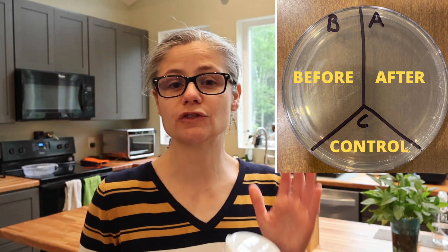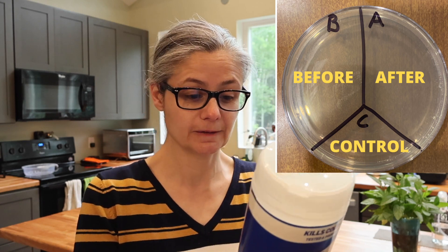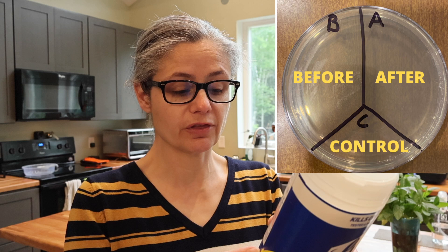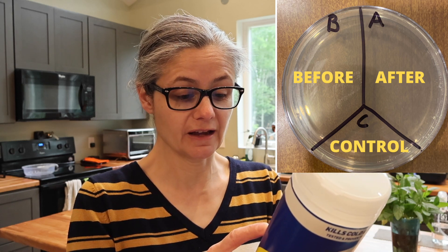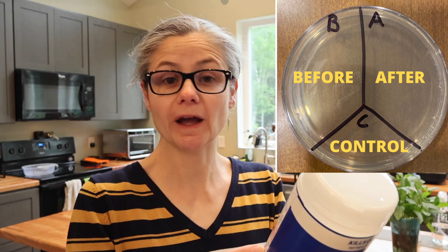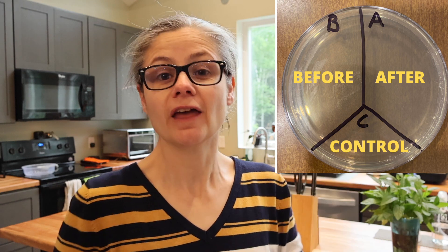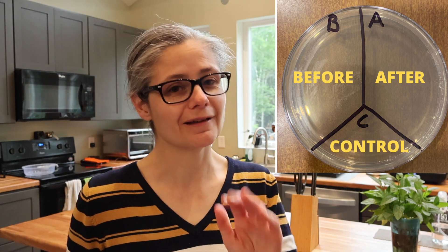Then I'm going to use the Lysol wipes according to their sanitizing instructions, which state: use enough fresh wipes to thoroughly wet the surface. The surface must remain wet for the entire contact time to sanitize — which means remove bacteria — and is allowed to remain wet for 10 seconds. Then I'll swab the area again and place that sample in the section labeled A for after. C is our control — nothing's going to go there. So let's see how well these Lysol disinfecting wipes can remove bacteria from my home.